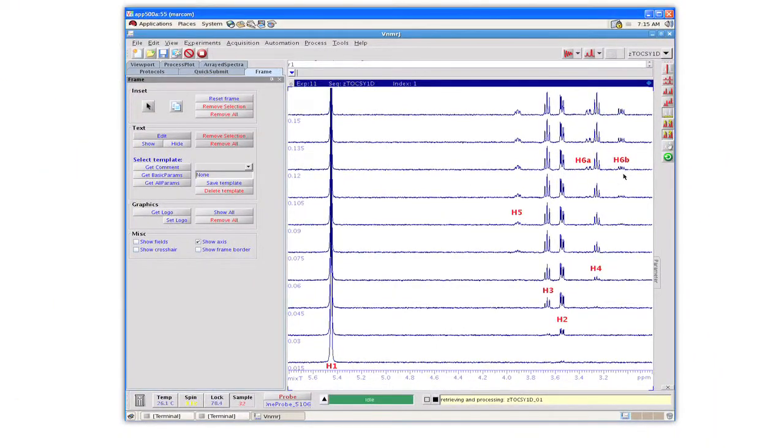In the past few minutes, you have seen part of the pulse shaping capabilities of VNMRJ3. It provides simple and user-friendly setup capabilities to run selective 1D pulse sequences and makes full use of a perfectly linear RF system to deliver reliable structural information.